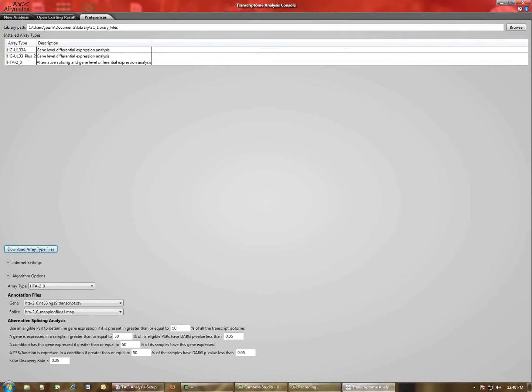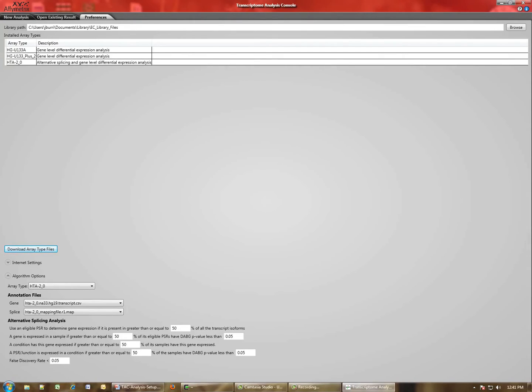The other thing that can be accomplished from the Preferences tab is to select the annotation files that you wish to use in order to perform the gene or the splice level analysis. If you're interested in adjusting the parameters associated with the alternative splicing algorithm, you can do so here.